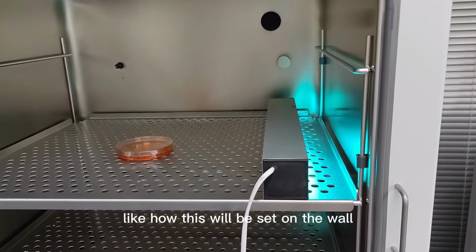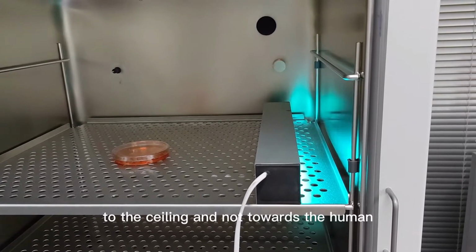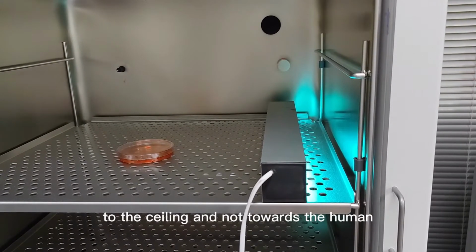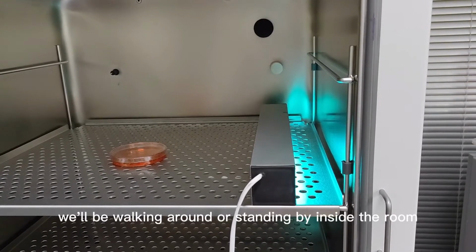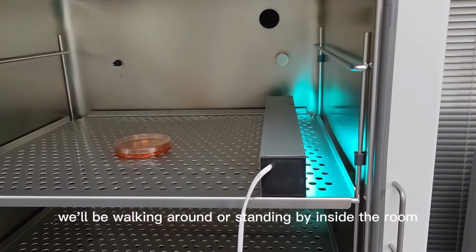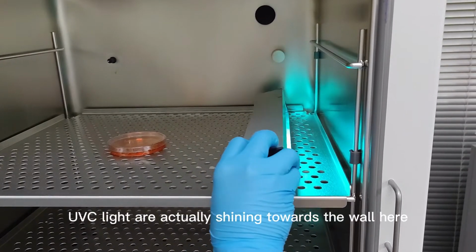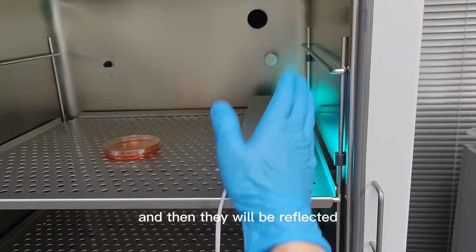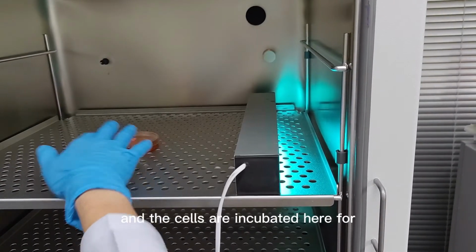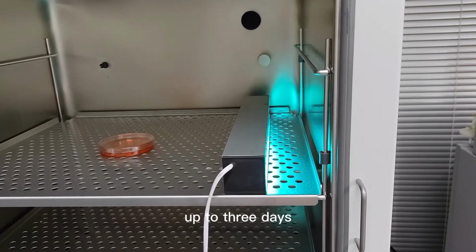which is similar to how it would be set on the wall, shining above to the ceiling and not towards the humans who will be walking around or standing inside the room. Similarly, you can see that the UVC light is shining towards the wall here, and then it will be reflected, and the cells are incubated here for up to 3 days.